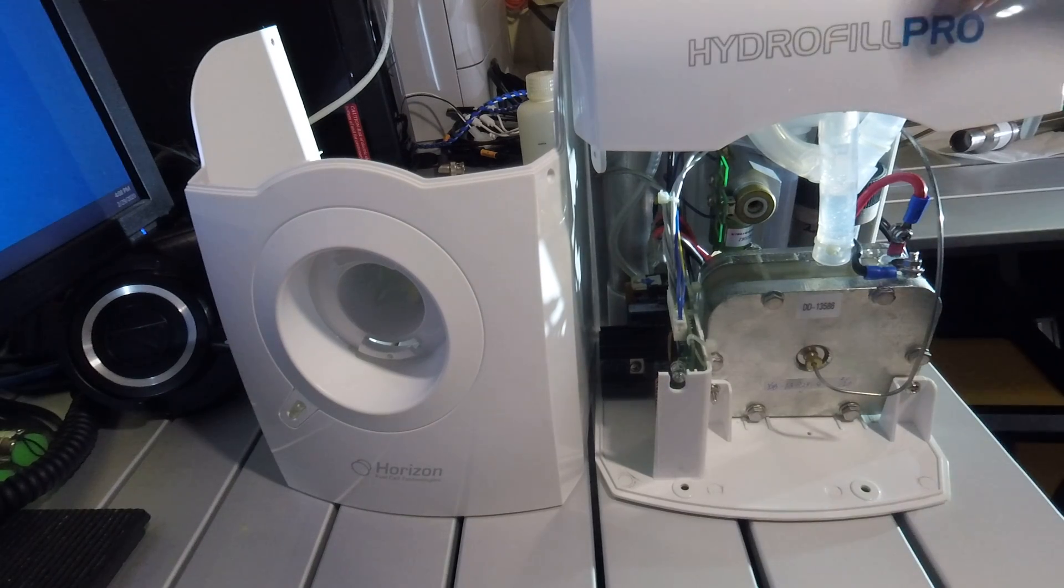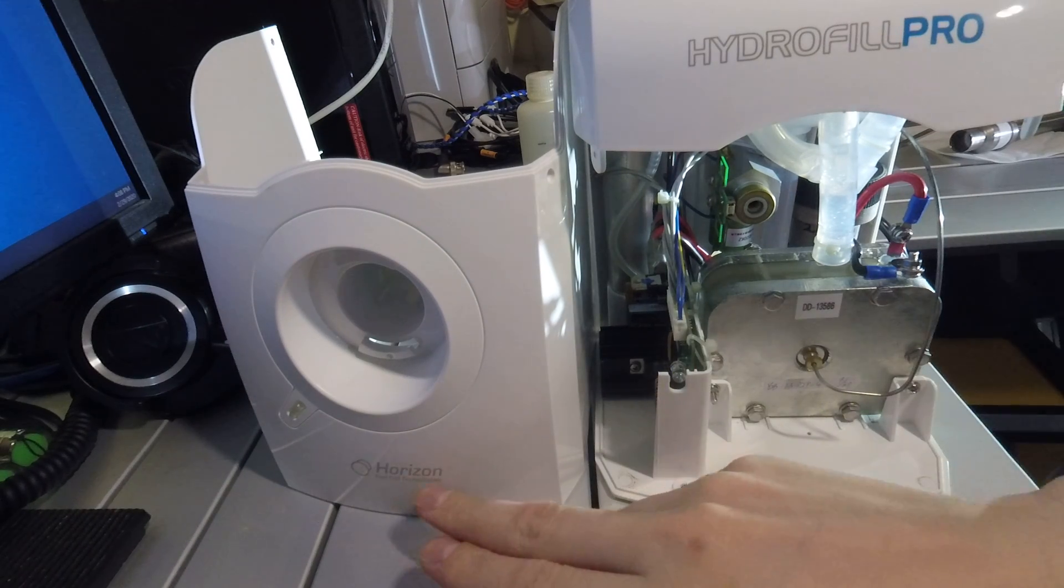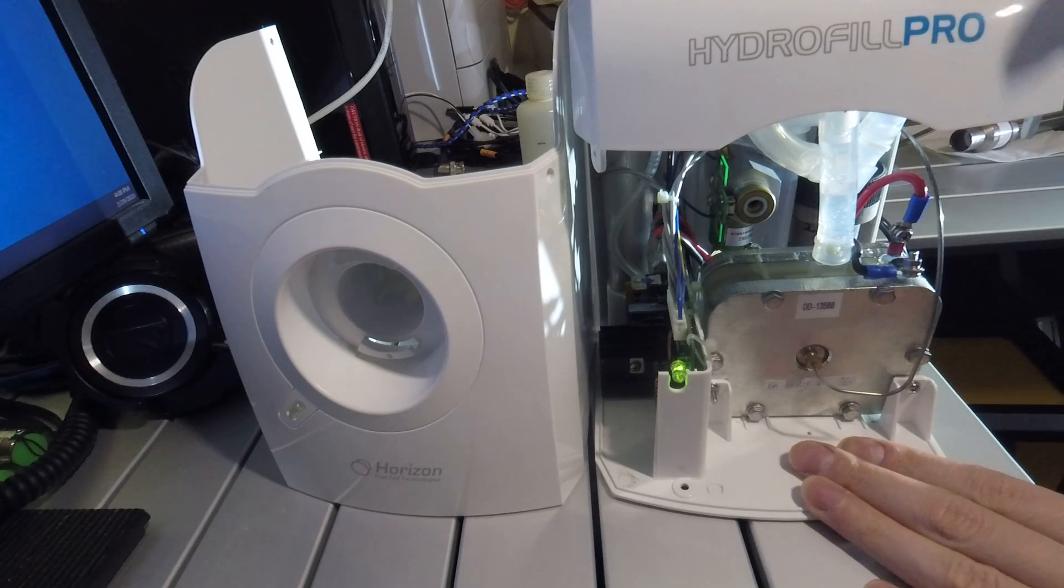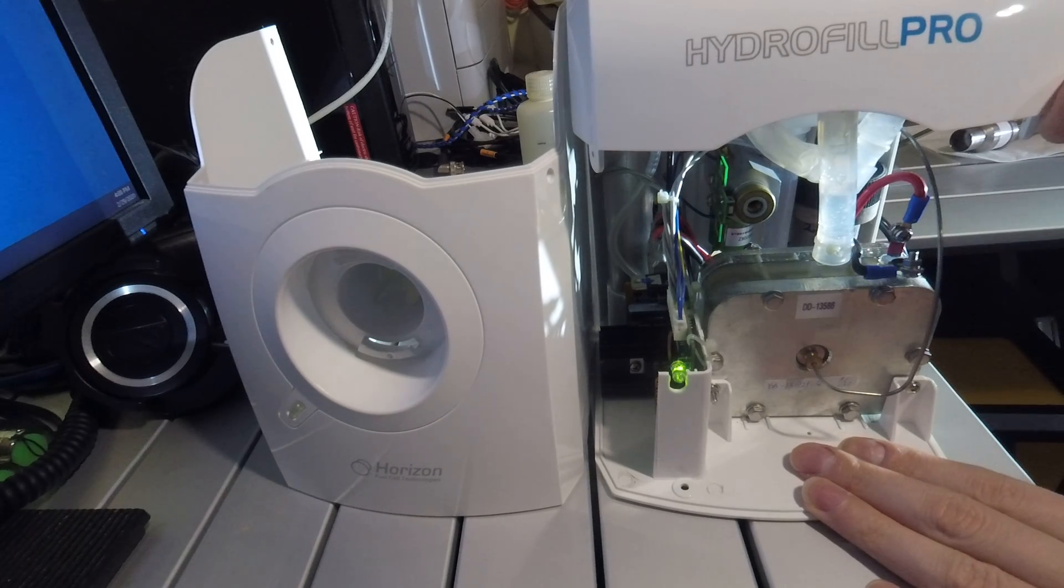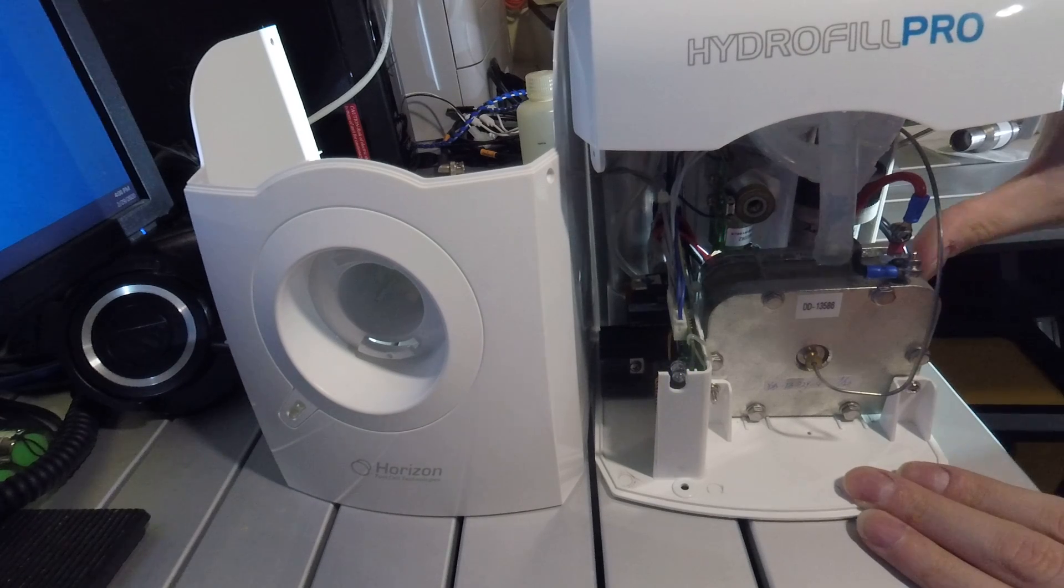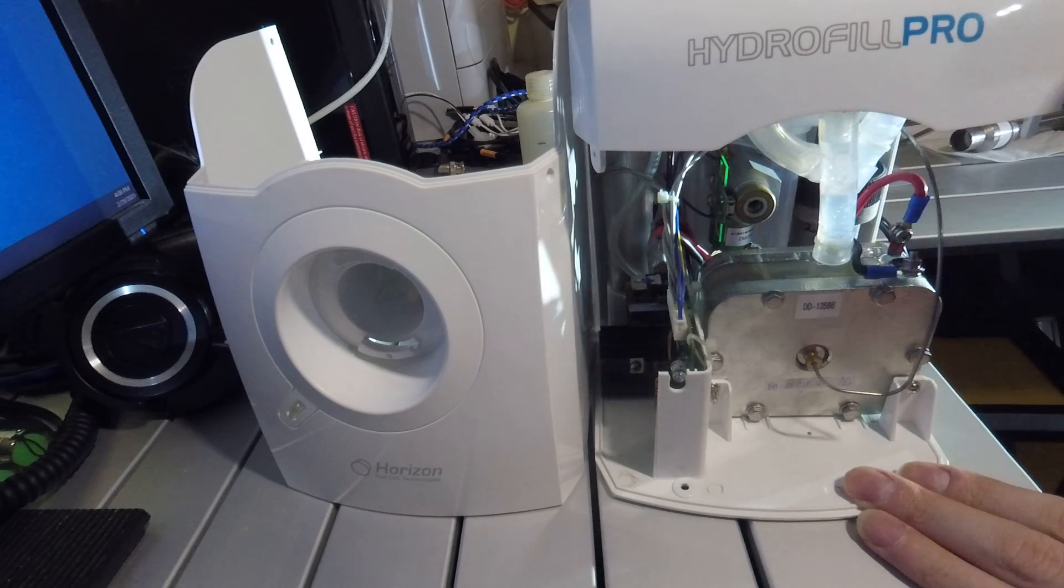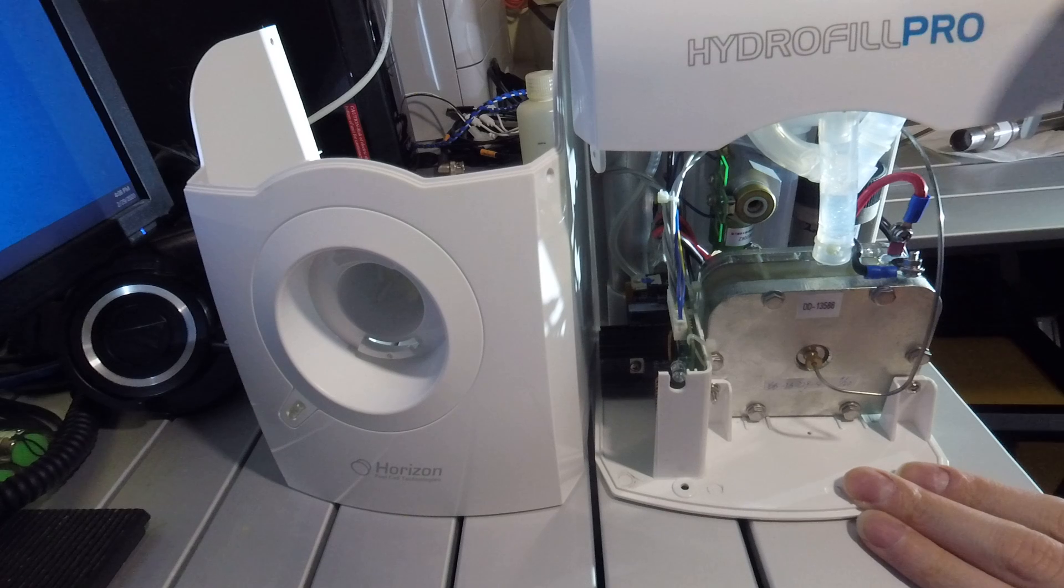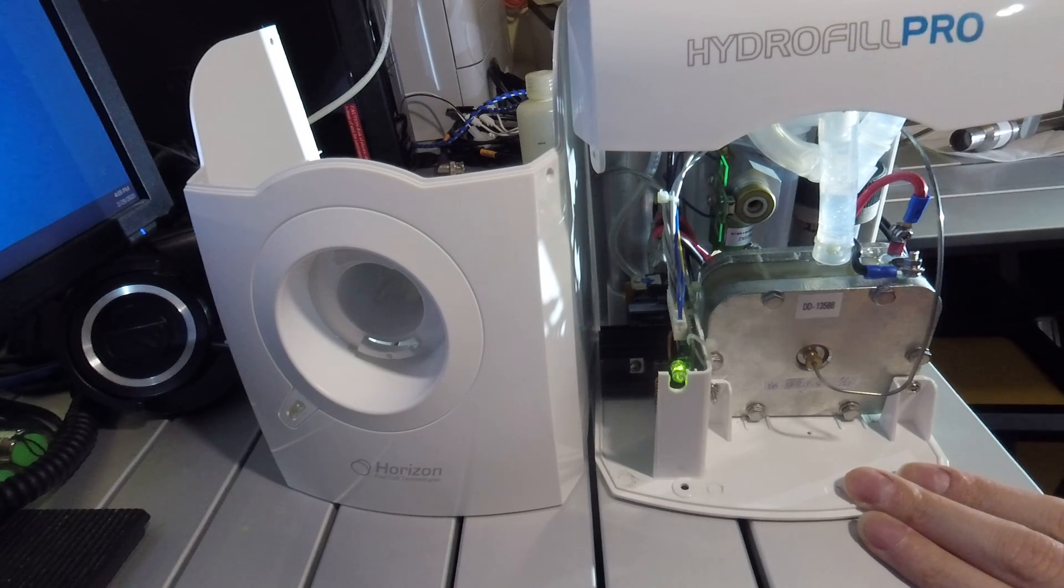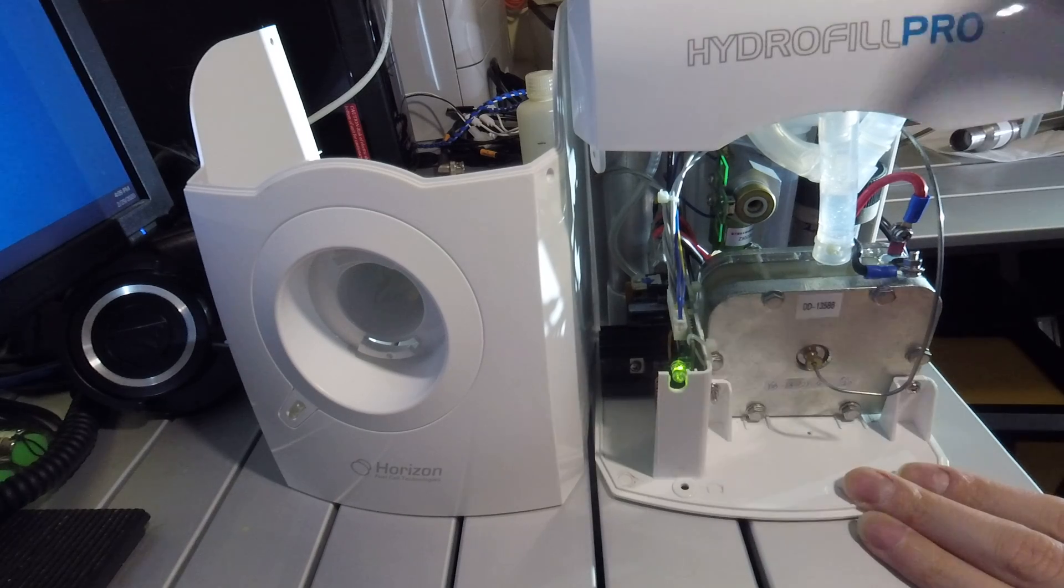This is the Hydrofil Pro by Horizon Fuel Cell Technologies. This is a portable small hydrogen generator that runs on a Proton Exchange Membrane Electrolyzer. Currently these can be purchased from FuelCellEarth.com for around $950.